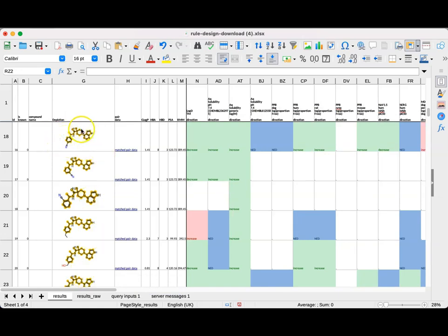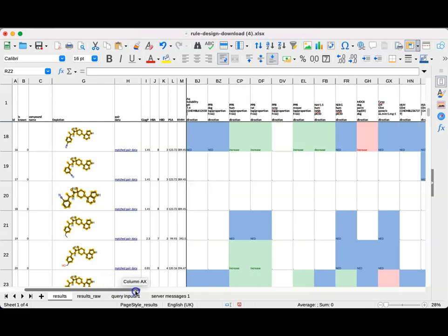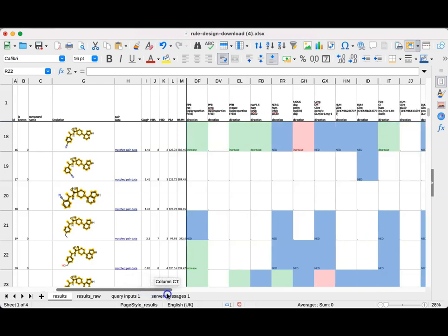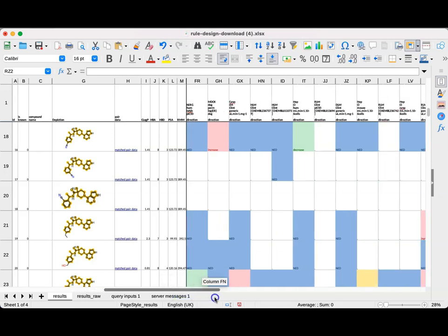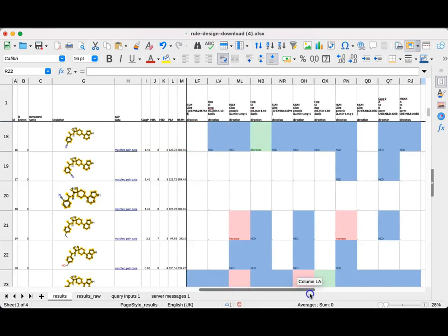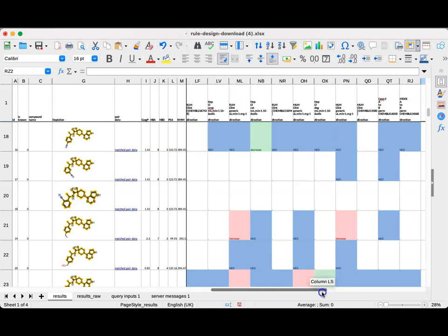We can now scroll across this row and we can start to see a reasonable amount of green. Green for log D, green for the solubility assays, which we asked for. We will come back to the NED in a second. There's then more green for free fraction, and as we scroll our way across, we can see more NED data. And down the other end, efflux ratio increasing for MDCK-MDR1, 1.5 decreasing. That's a good thing, and we see that hERG is a NED as well.